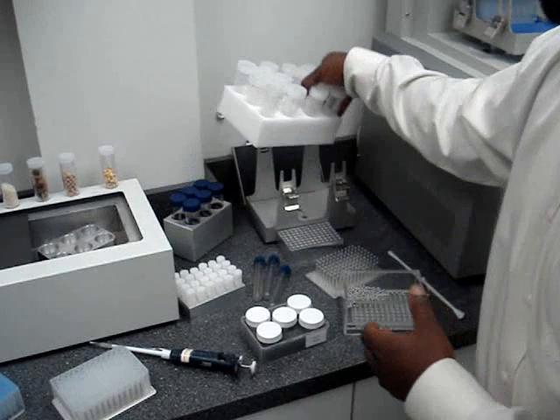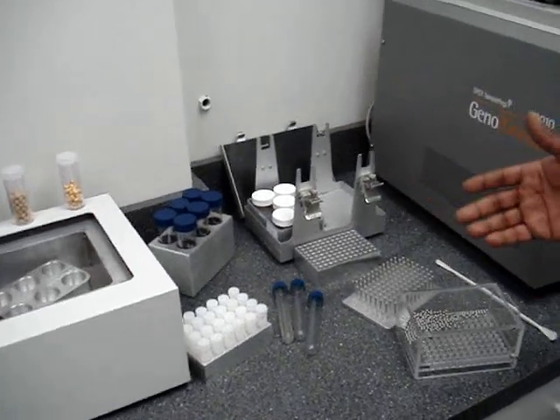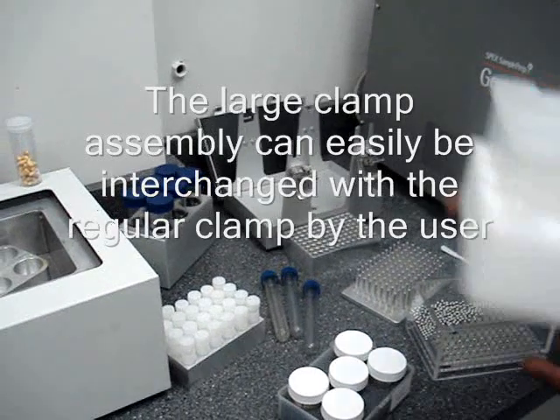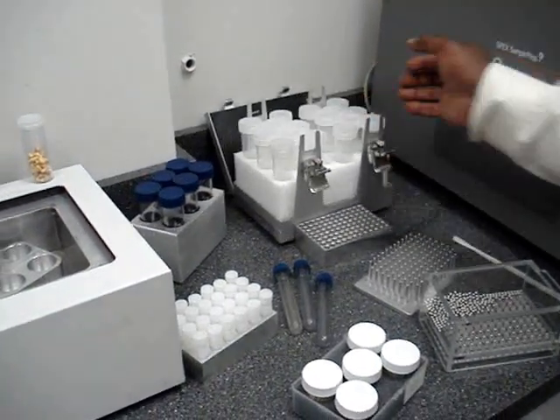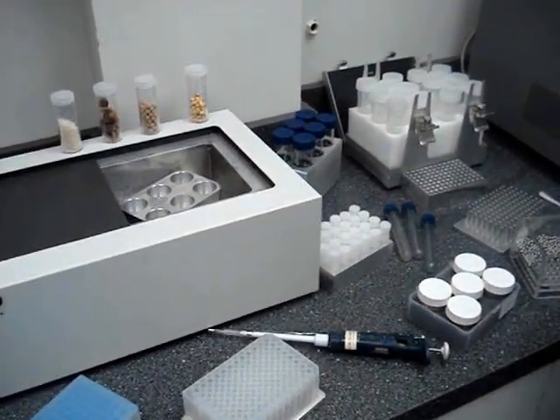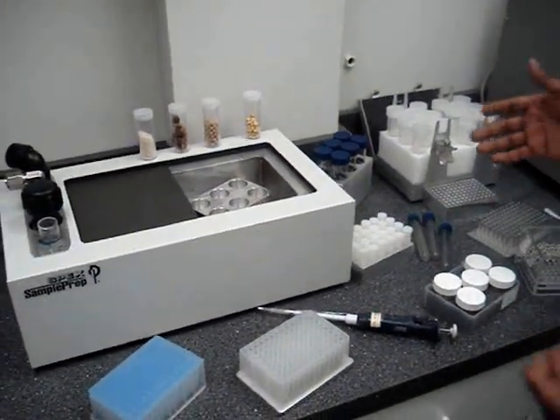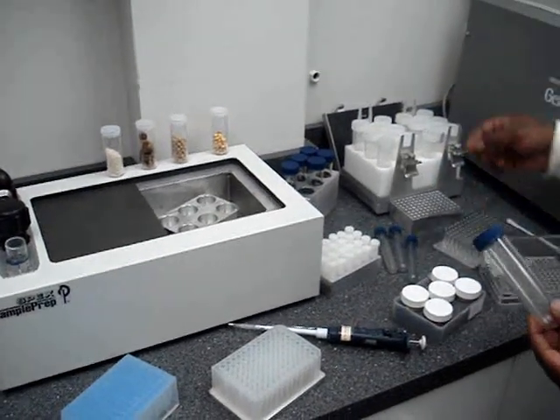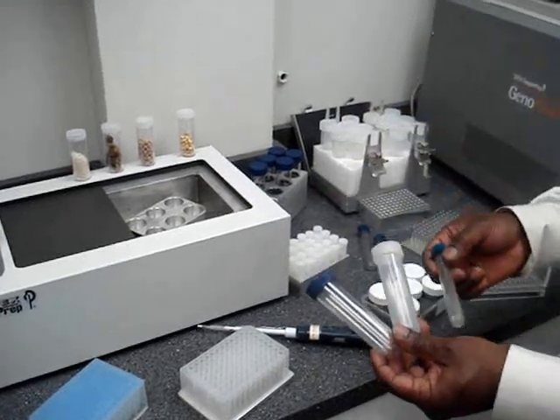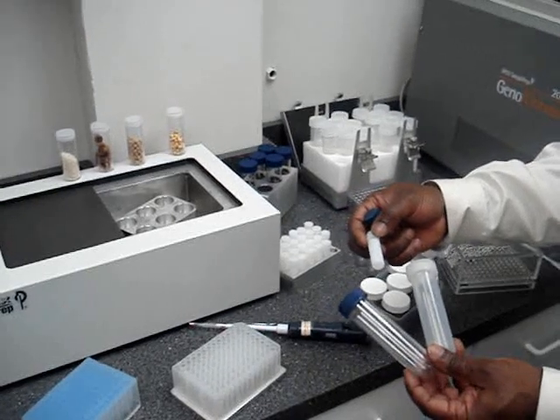As you can see, by taking this out and replacing it with this, stacking them, you can actually do a number of different samples at one time. The throughput is tremendous. The Geno Grinder is also capable of doing samples at cryogenic temperatures, low temperatures almost at liquid nitrogen temperatures, with our specially designed vials. These are all manufactured by Spex Sample Prep — 15 mLs as well as 5 mLs — specifically designed for low-temperature grinding.